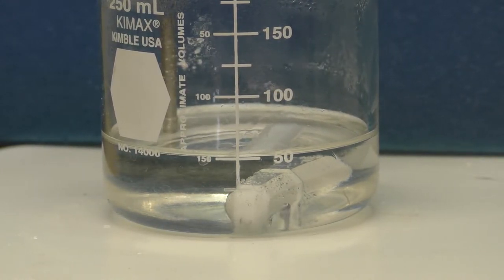The solution has now reached a gentle boil. We'll let this sit here, probably turn the stirring back on for about 15 minutes, and then we'll stop the reaction and work up the solution.